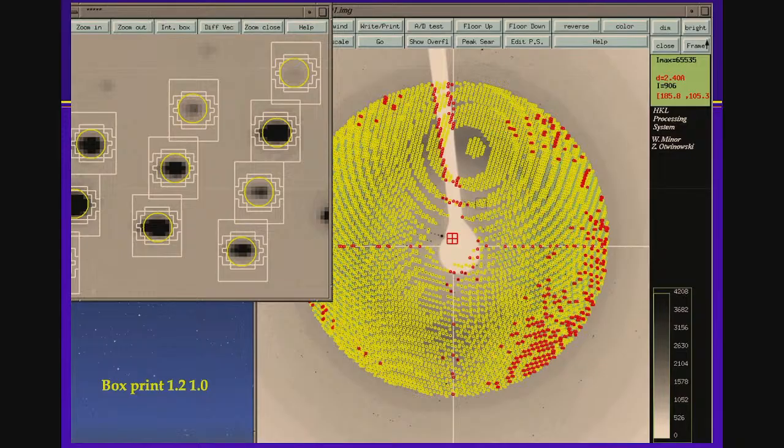We can predict where the spots are. Then you can see each spot predicted, and they are enclosed here, so you can now calculate the intensity for each of these spots. Also, by doing the prediction, you know the index of the spot as well. This spot has some index, and you can calculate its intensity. The next spot here is much darker, so stronger than this one. It may seem to be a very complex process to do manually, which is true. For a computer, this is a piece of cake. It takes less than a second.